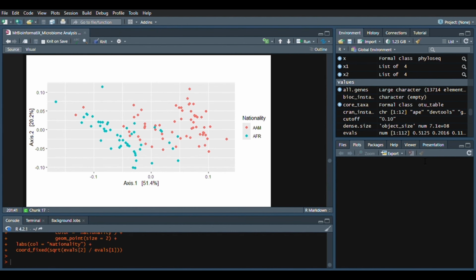To visualize the differences in microbial composition among subjects of different nationalities, we will create a plot showing microbial abundance. To effectively understand and compare microbial communities, we often visualize them using stacked bar plots. Each bar represents a specific sample, showcasing the diverse array of microbes present and their relative abundances. This visualization allows us to identify which microbes dominate in each sample or across different groups.